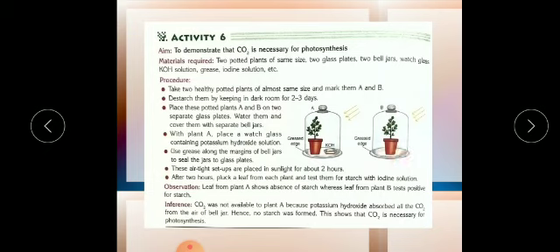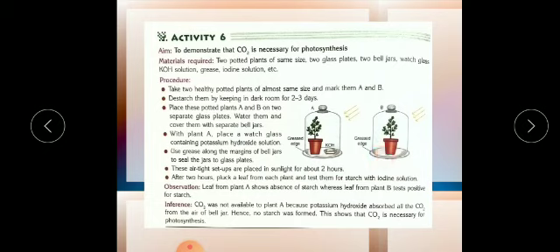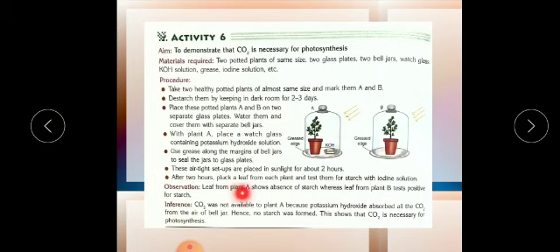The bell jars are transparent so sunlight can pass through. Carbon dioxide is already present inside the bell jar from the air. Plant B will have CO2, water, sunlight, and chlorophyll — all four conditions for photosynthesis. After making both setups airtight, place both under sunlight for two hours. Then pluck one leaf each from setup A and setup B and perform the starch test using all four steps.